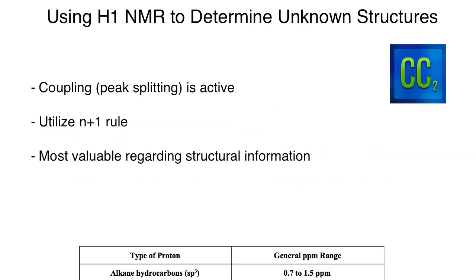Alright, welcome back everyone, and we are now finally ready to do the H1 NMR, also known as the Proton NMR section of the course. This is the last lecture portion of this course. There will be a practice session to wrap things up in one final session, but this is going to be the last of the lecturing material.